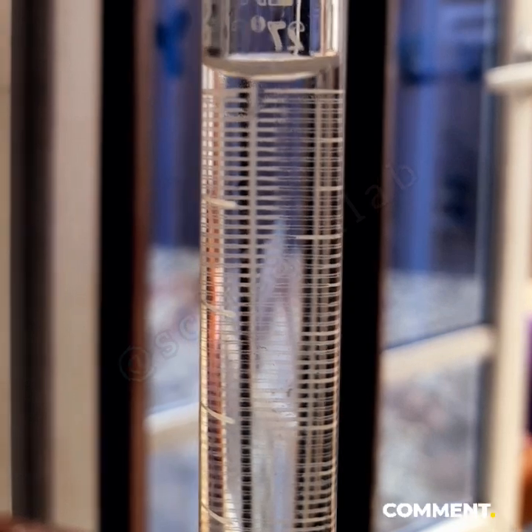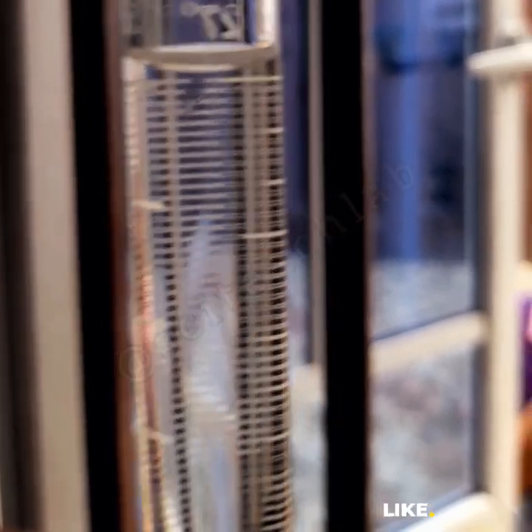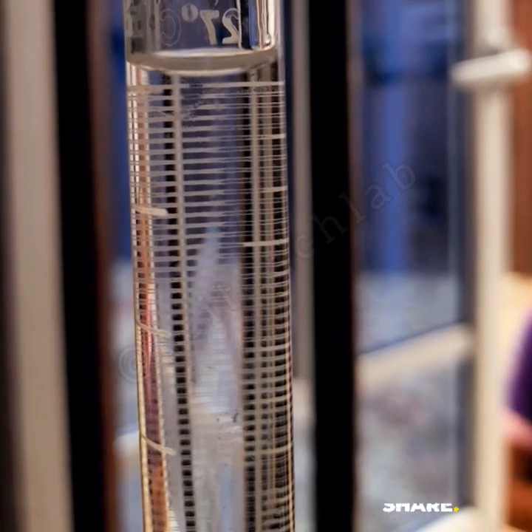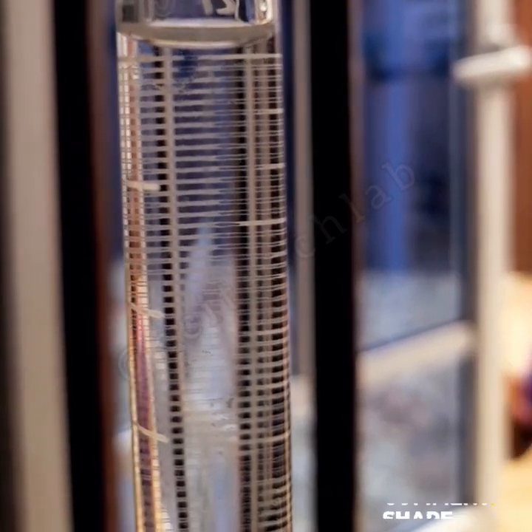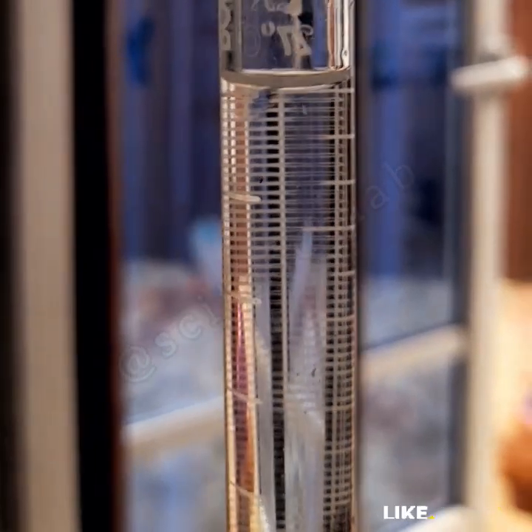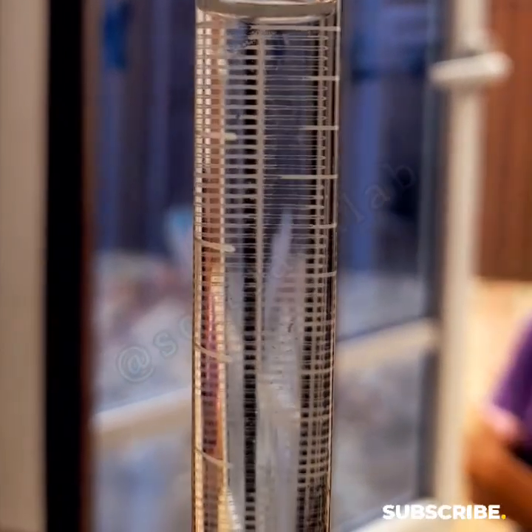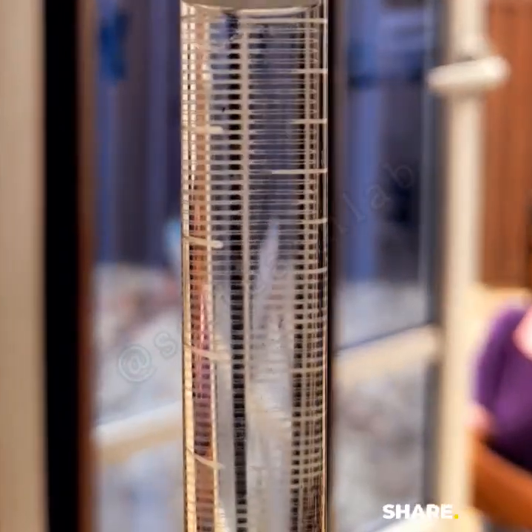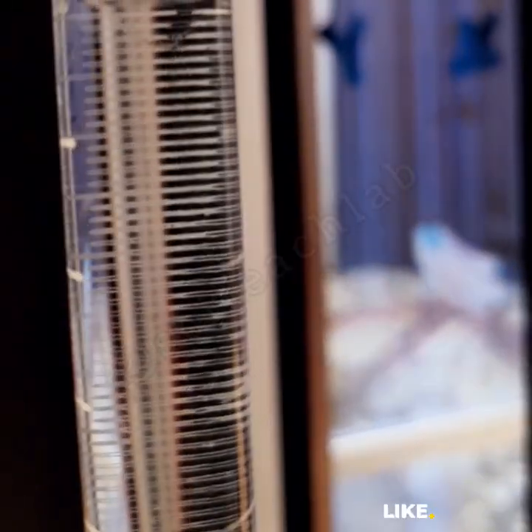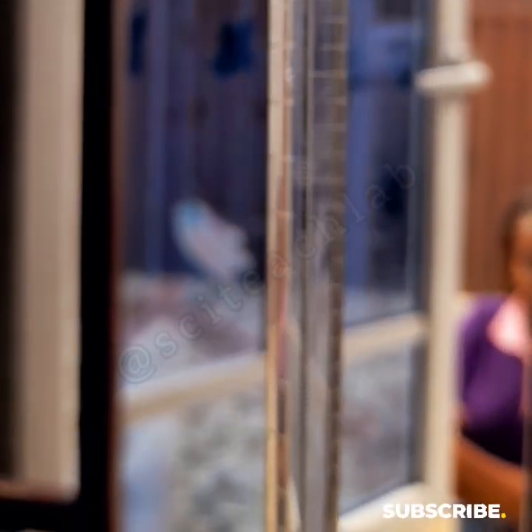Go. Okay, so it doesn't sit. We have to carefully make it sit, and it sits. All right, so that means that is 50 cm cube of A, of D, of the acid HCl, filled into the burette.